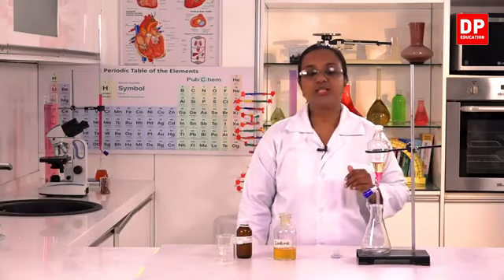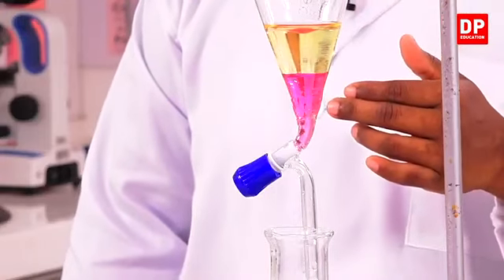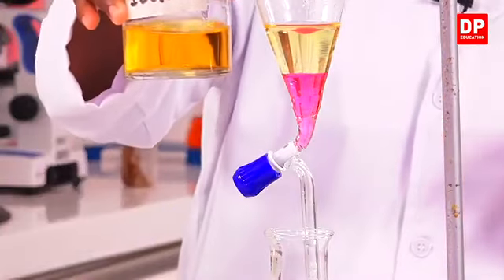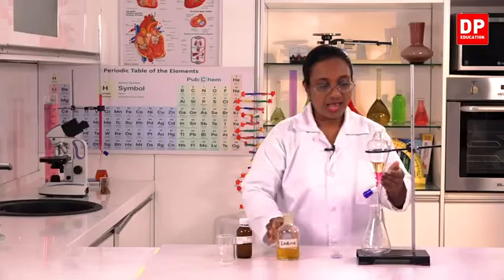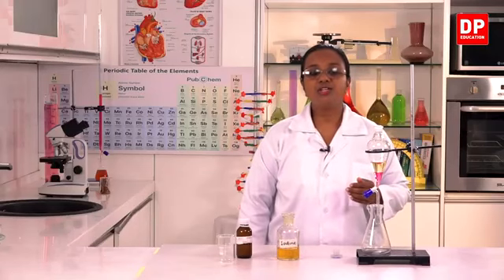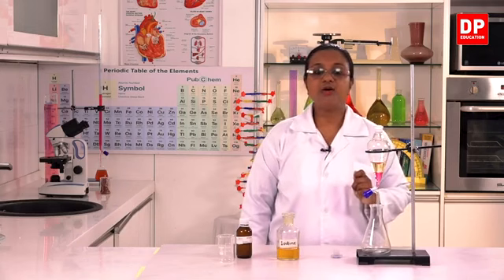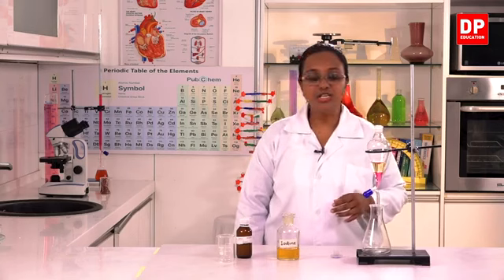Earlier, this was darker in color. The iodine in water was very much more brown. Here you can see the colors. Now it has become very light. And also the carbon tetrachloride was colorless, but you can see now it is purple in color, pink or purplish in color.